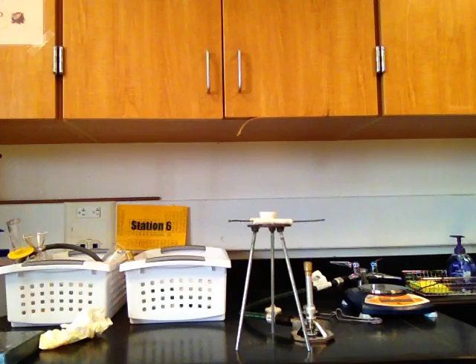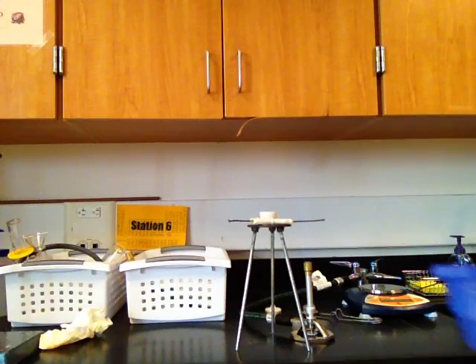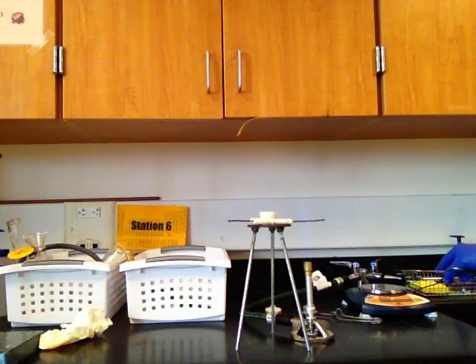Once you have purified the crucible, you do not want to touch it by hand, because the oils from your fingertips will be left on the crucible. Once you take your hand next to it and it has cooled enough, now you weigh the crucible on the balance and take the mass.